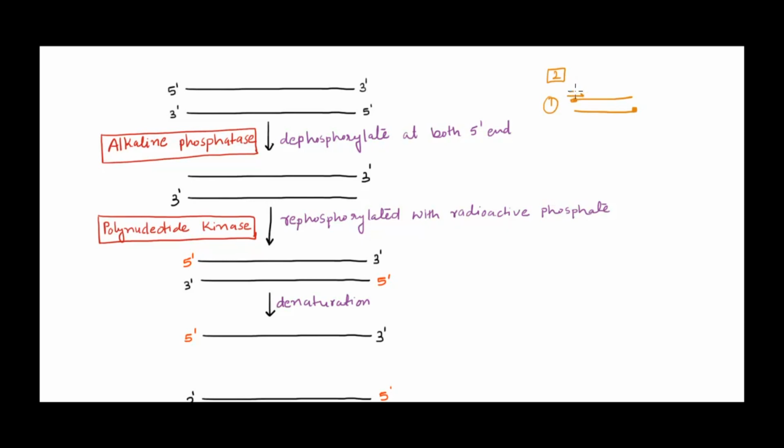Suppose I'm reading ATGC, that nucleotide is away from this particular tag. It should specify the direction in which we are reading the nucleotides. So tagging would help us to determine the specific location or position of that nucleotide in one particular direction. And when it comes to DNA, the best tagging method would be tagging the DNA with radioactive phosphate.